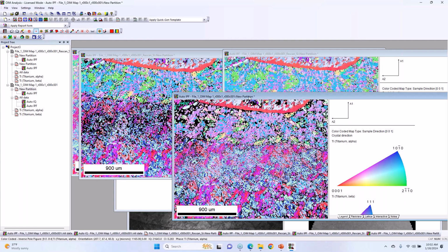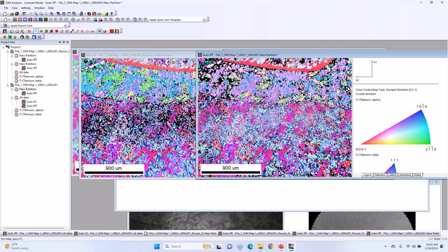This area through here, I'd want to look at in a bit more detail to see why it's not getting as much data as before. I think that comes down in part to a big variation in signal intensity from left to right sides, so that's an average, and maybe another background, like a dynamic background, might be useful.